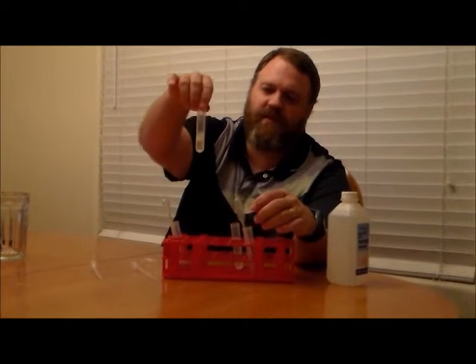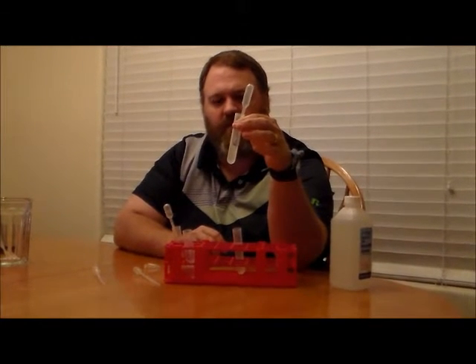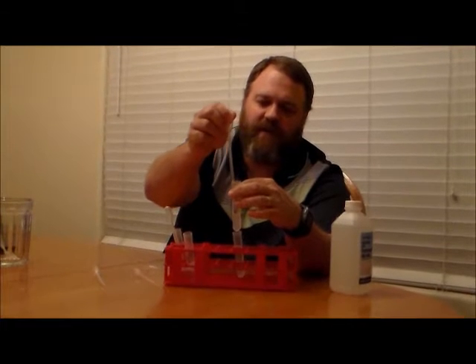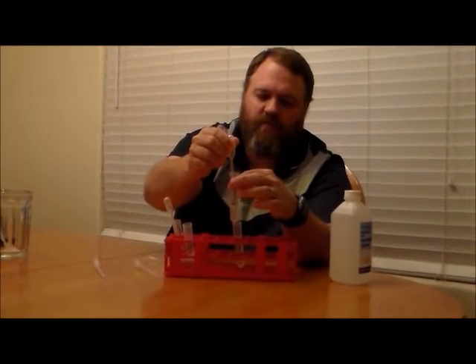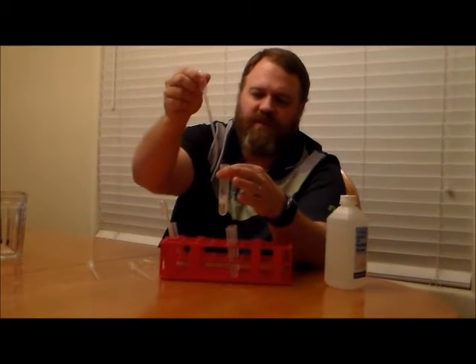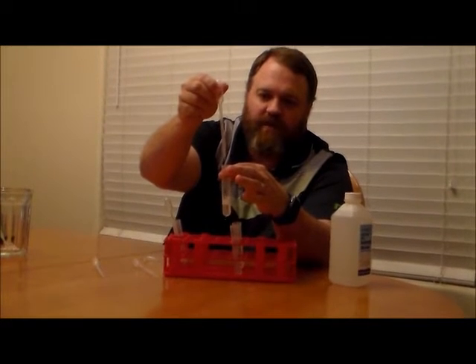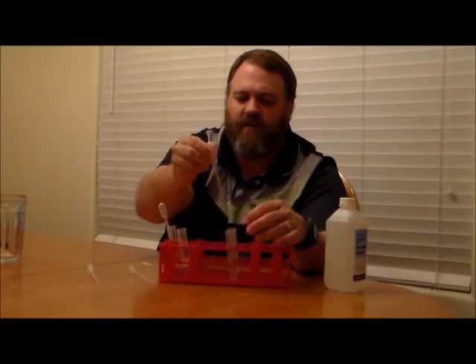The next step in our extraction process is to add to our test tube — which contains our cells dissolved in the soapy water — a few drops of the enzyme solution we mixed up earlier. This enzyme solution is basically a small amount of meat tenderizer dissolved in water. To add it, I'm going to use one of the micro-tip pipettes and add about eight drops of the enzyme into my test tube labeled 'cells.'